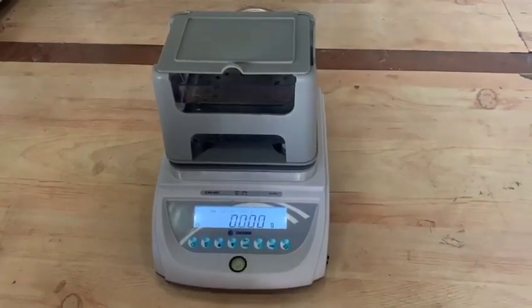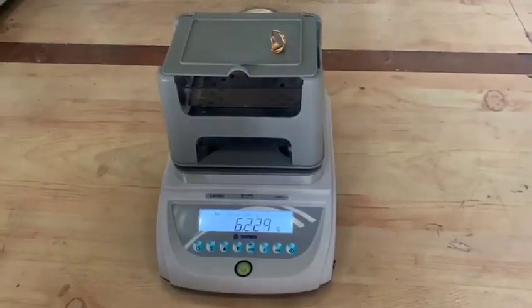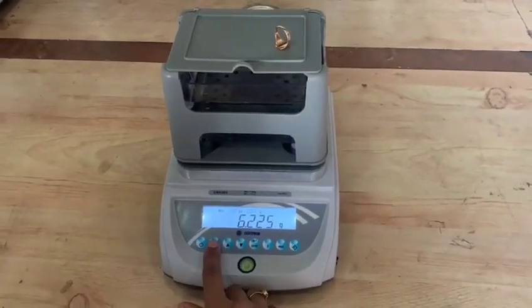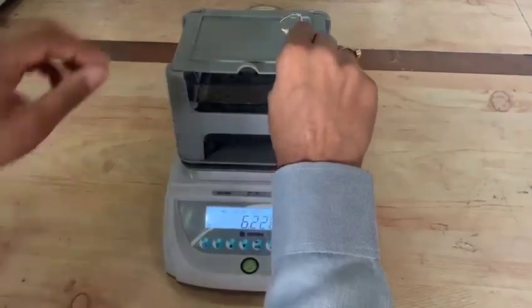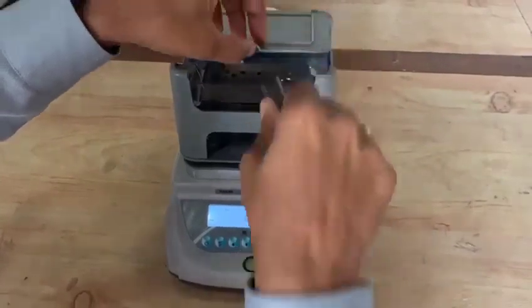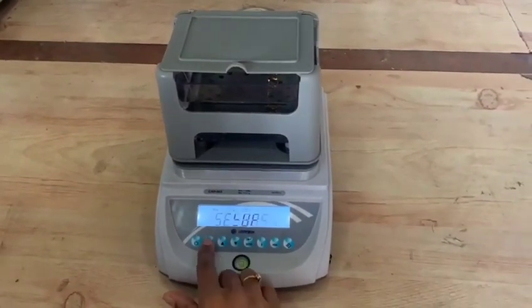Temperature of the distilled water can also be set to obtain the precise density value. The gold sample is weighed first in air and then in water, and the balance calculates the percentage purity value and carat value of gold using the software.